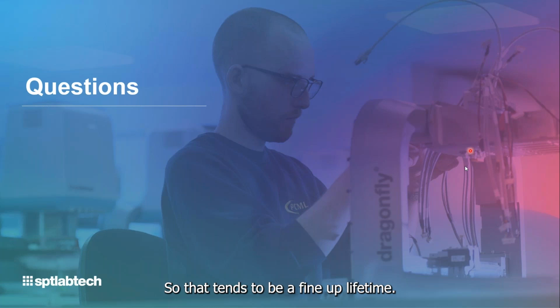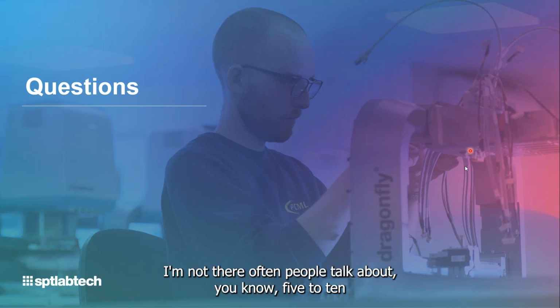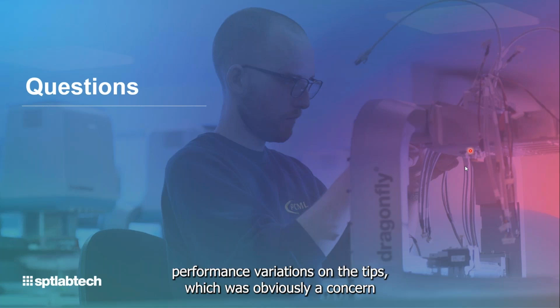So that tends to be a finite lifetime, and you often hear people talk about 5 to 10 reloadings of the tips, but even after one reloading, you may start to see performance variations on the tips.